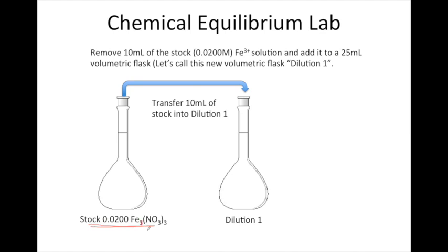Oops, that shouldn't be there. Our stock iron 3 nitrate should be about 0.02 molar. You'll get the actual concentration when you get to the lab.